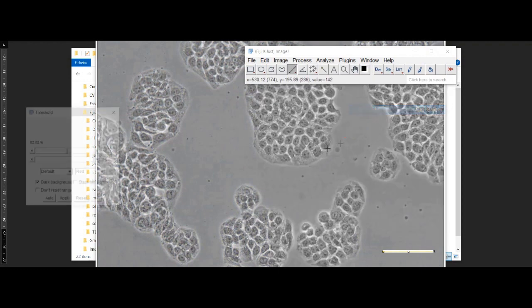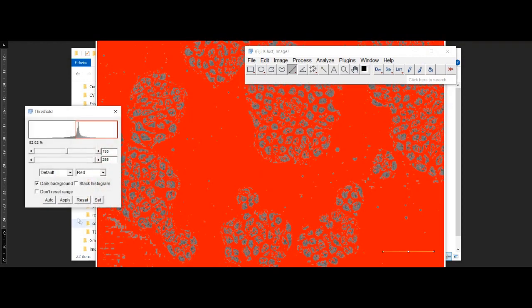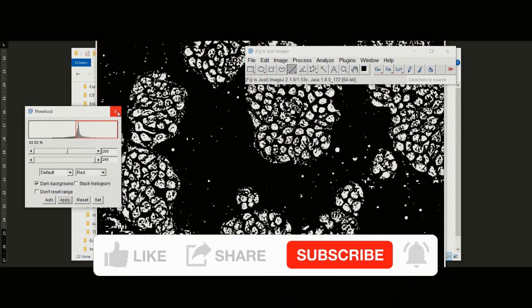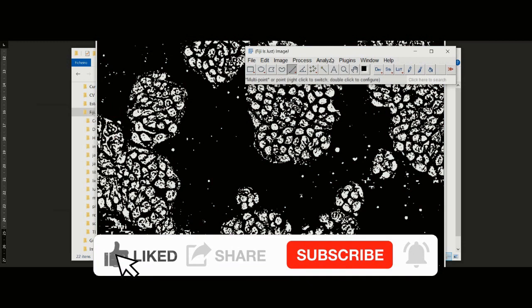Now that we have our cells highlighted, we can use the particle analysis tool to count them.